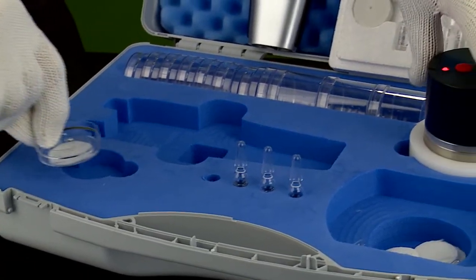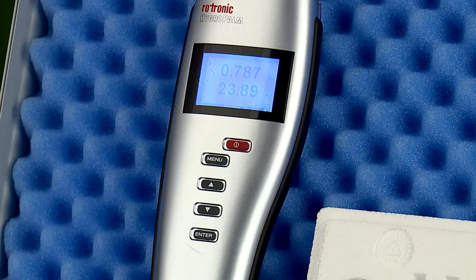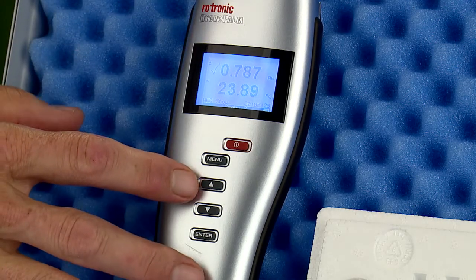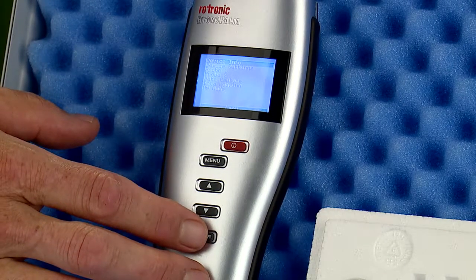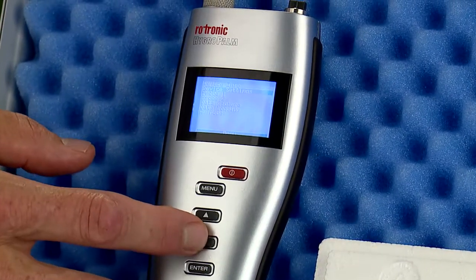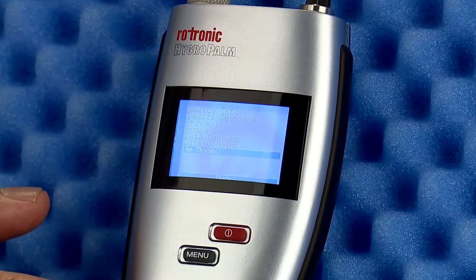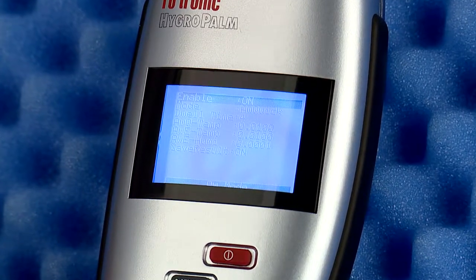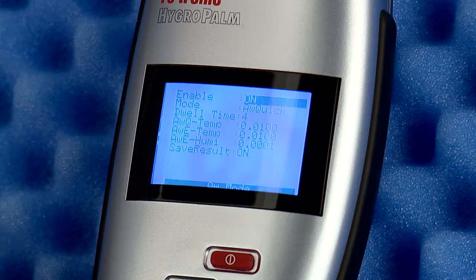Each calibration solution should soak with the probe on the solution for a minimum of 45 minutes. While waiting, it is a good time to change the settings on the HP-23AW to ready the instrument for calibration. Press Menu, navigate to the AW mode option on the first menu, select Enable, and turn this selection to Off.